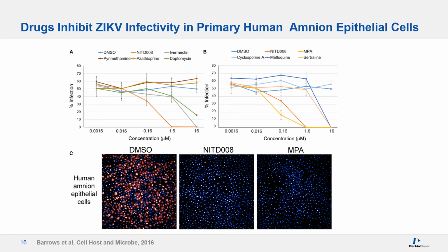For comparison, the positive control NITD-008 and negative control DMSO were compared respectively. This study identified drugs that could be tested in clinical studies of Zika viral infection and provide resources of small molecules to study Zika virus pathogenesis.